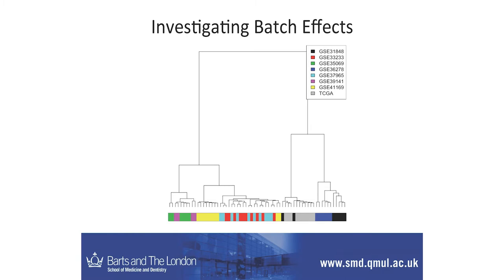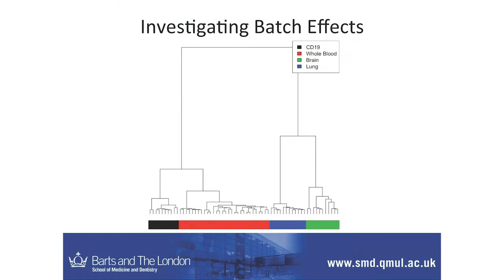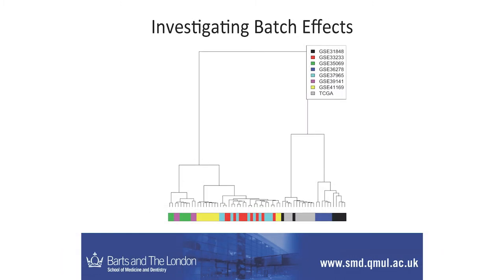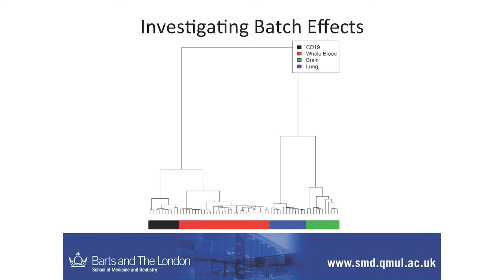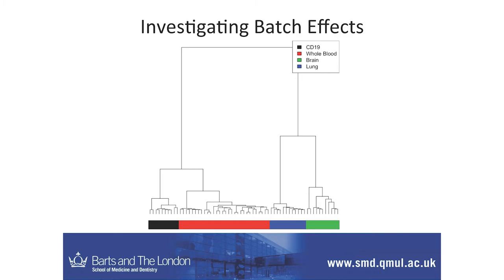People are always worried about batch effects. Here we have a number of different studies, essentially random, and you can see some big clustering. They're coloured by their experiment, and they're not really clustering together purely by experiment — there's some commonality, but that's more to do with cell type. What's really interesting is you can see a different blood separation of what's been labelled as whole blood. You might think that's a batch effect, but there's another batch from the same experiment over there. So clearly, although it's whole blood, there's something different in terms of the proportion of cells in that blood.